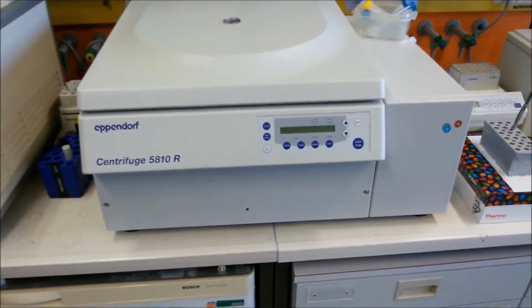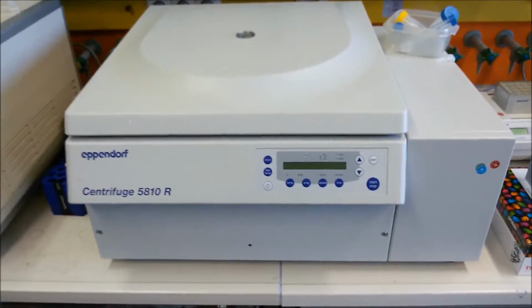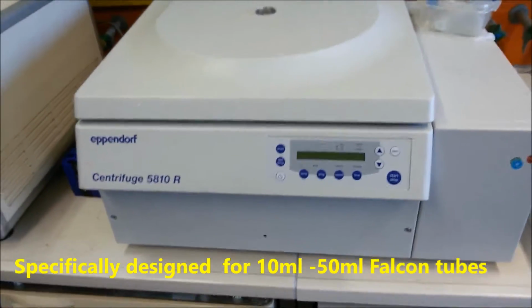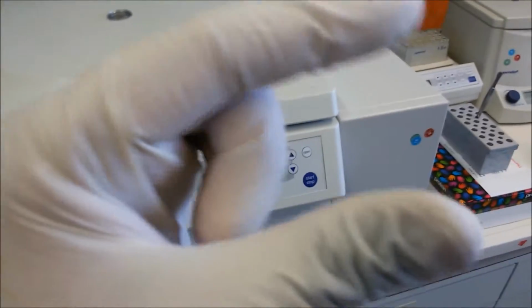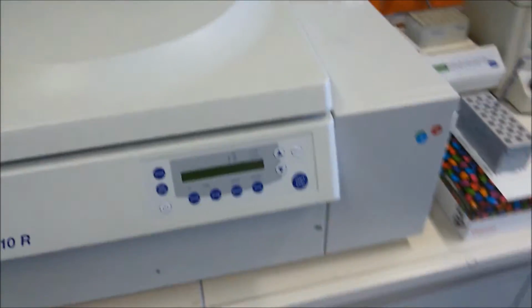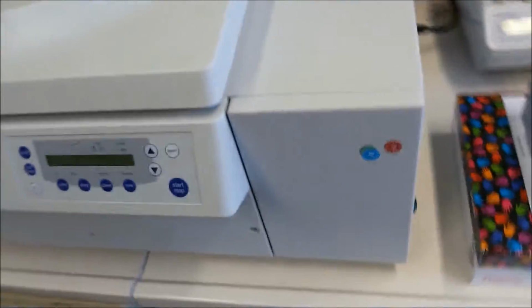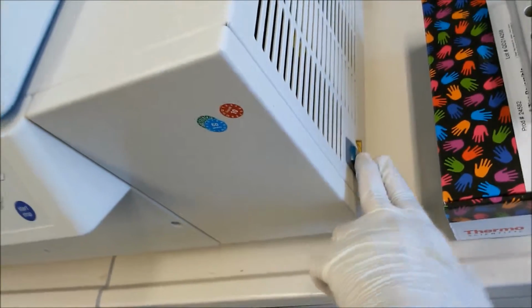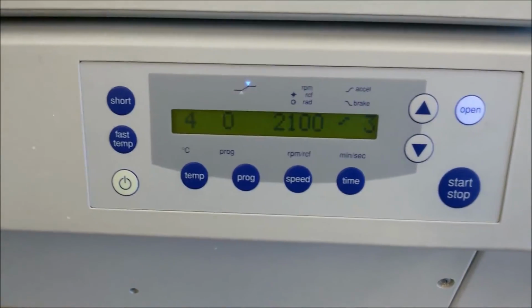And now I will show you a big tabletop centrifuge. This is also temperature regulated, but this is for a different purpose. So the previous two centrifuges are for the Eppendorf tubes, the small 1.5 ml tubes, and this one is for the Falcon tubes. So we will have a look at it. We have to switch it on first. We can use this knob just next here. Yeah, we press it, we switch it on, and we can see.